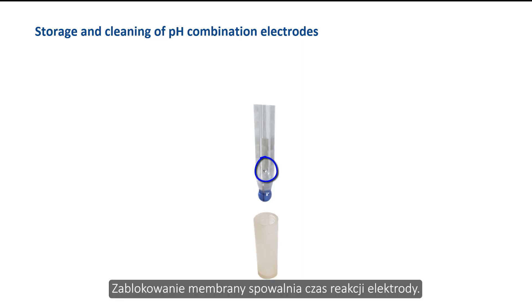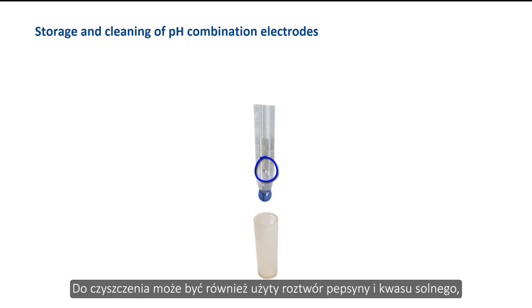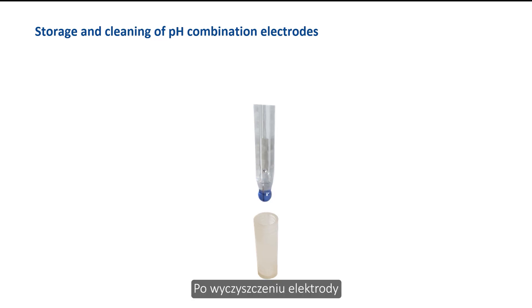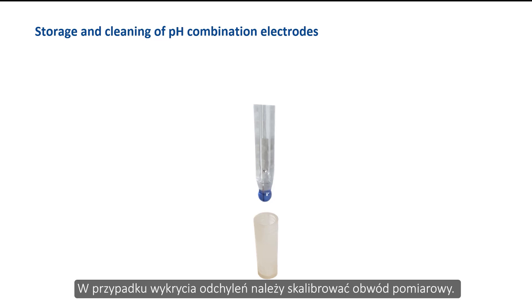Blocking of the diaphragm slows down the response time of the electrode. This effect can often be reduced by cleaning the diaphragm with a brush. A pepsin hydrochloric acid solution can also be used for cleaning, which reduces both protein and chalk deposits. After cleaning the electrode, rinse it and check the function with buffer solutions. The measuring circuit must be recalibrated if deviations are detected.